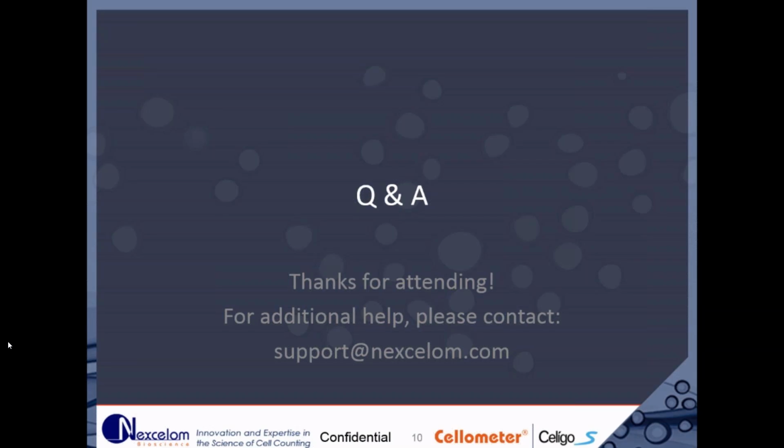So it's variable. But as a golden rule, what we tell people is for one channel, it takes between 5 and 10 minutes. So if you did 3 channels, figure it's about 15 minutes. Thank you.